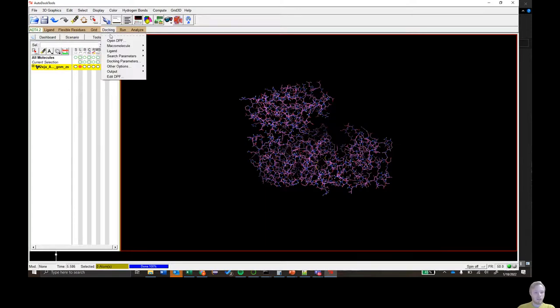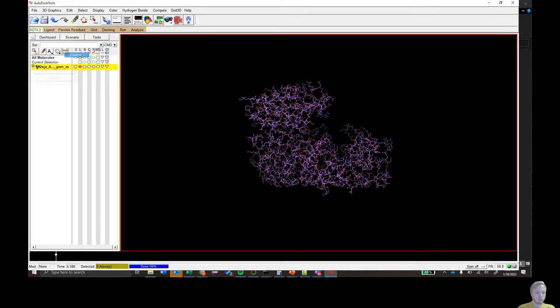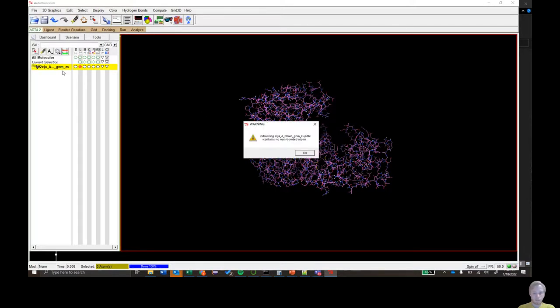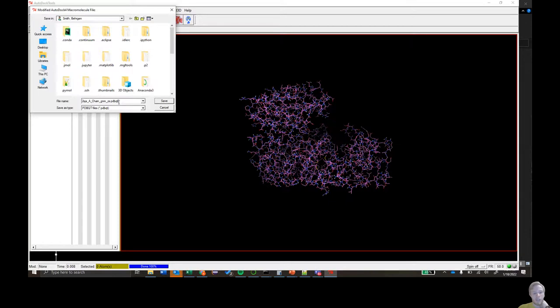Then click Docking, Grid, Macromolecule, Choose. Click on your protein, then click 'Select Molecule'. A warning may pop up saying it has no non-bonded atoms — just click OK. Now we have to save it as a PDBQT file. The PDBQT format is like a PDB file except it also contains the charge and type columns.